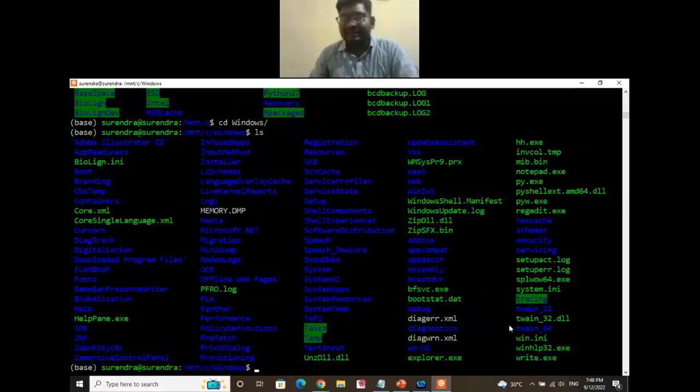You can check the content of the Windows directory. So that is how you can use the cd command to navigate to the other places.